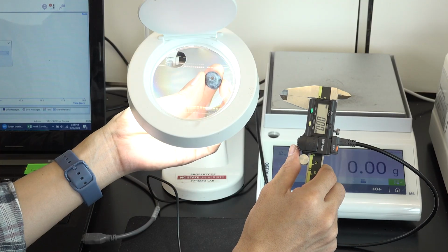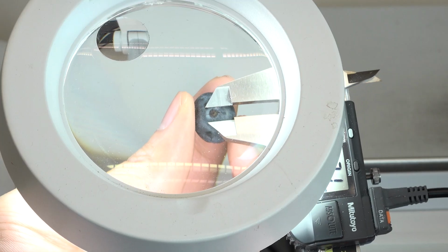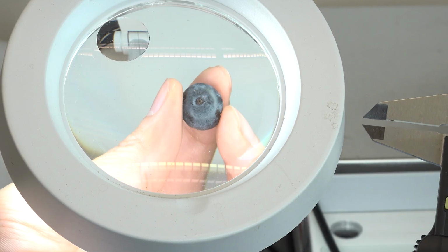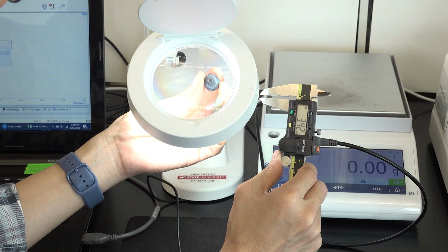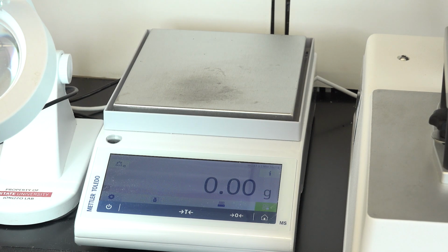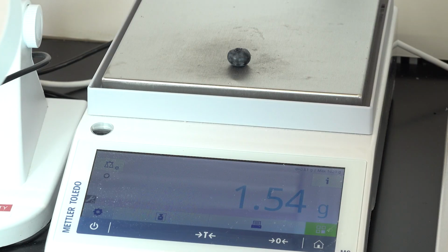You can also integrate devices like a digital caliper to measure the stem scar diameter of a berry. And the data that you collect from the caliper will be automatically sent to the laptop or the macro. You won't need to measure the diameter of the whole berry because the texture analyzer will automatically measure the diameter. You can also attach a scale to the macro so that you can send the weight of the berry to the macro, and the resulting Excel sheet would have the weight along with all the texture parameters that you measure for each sample.